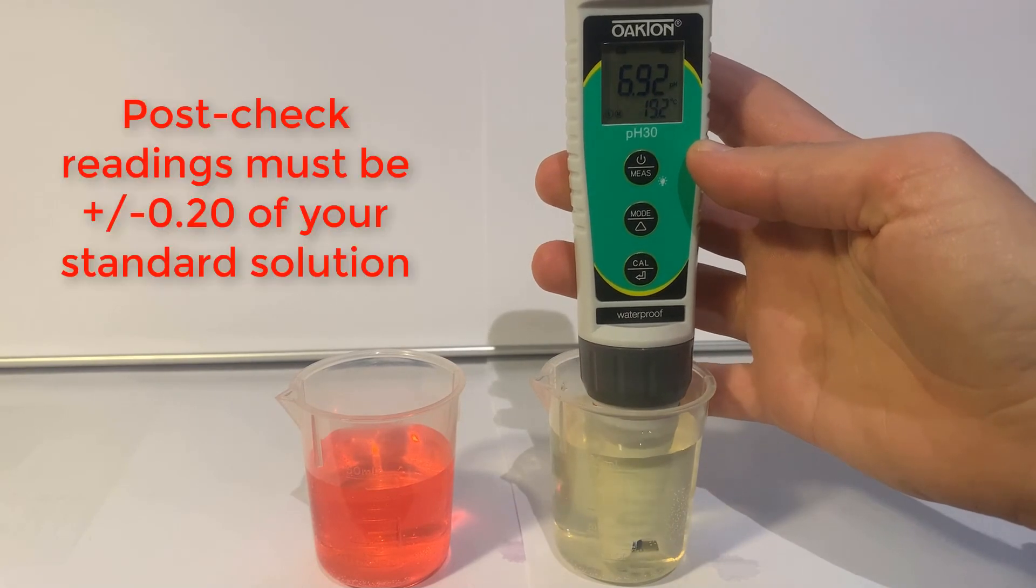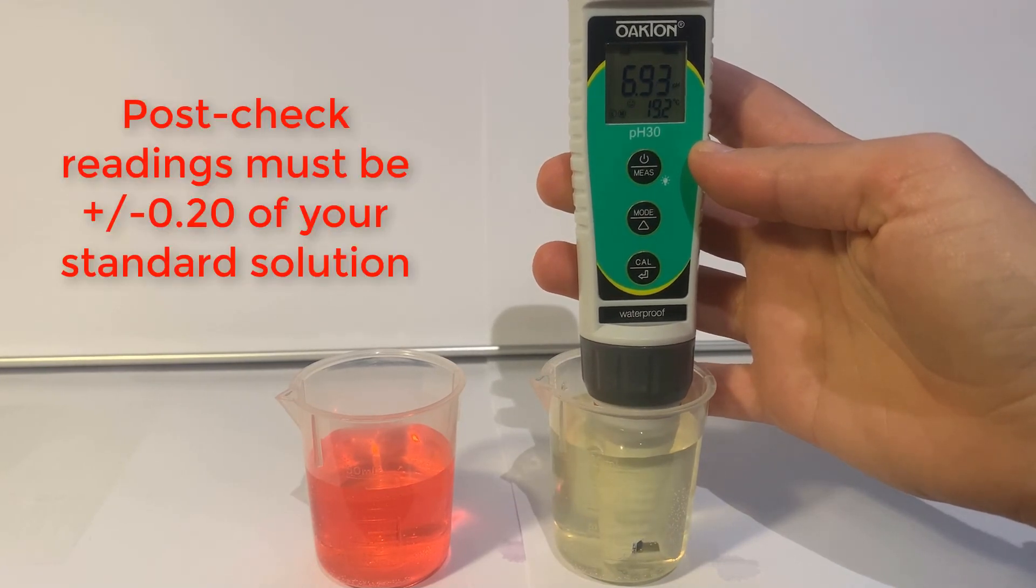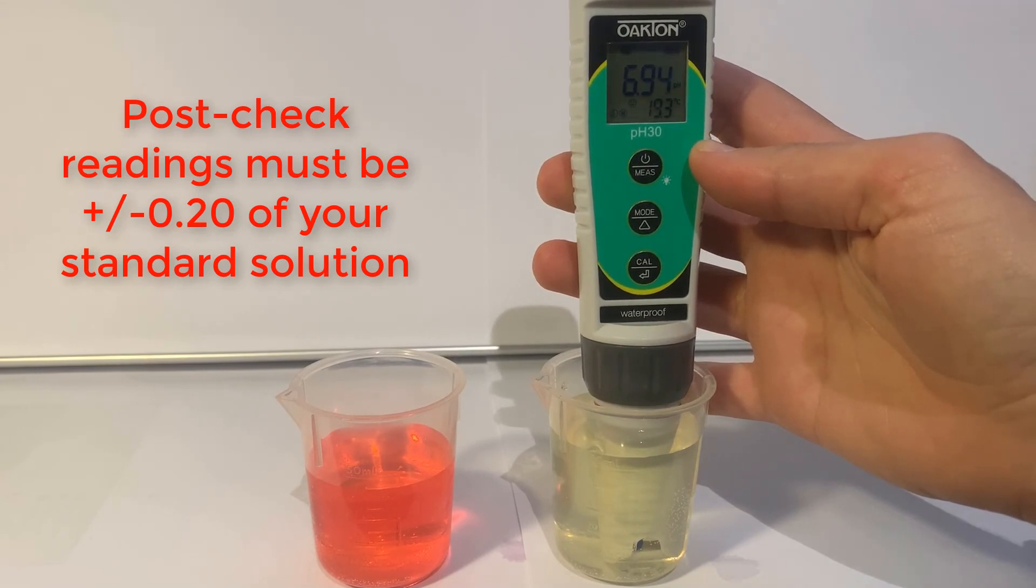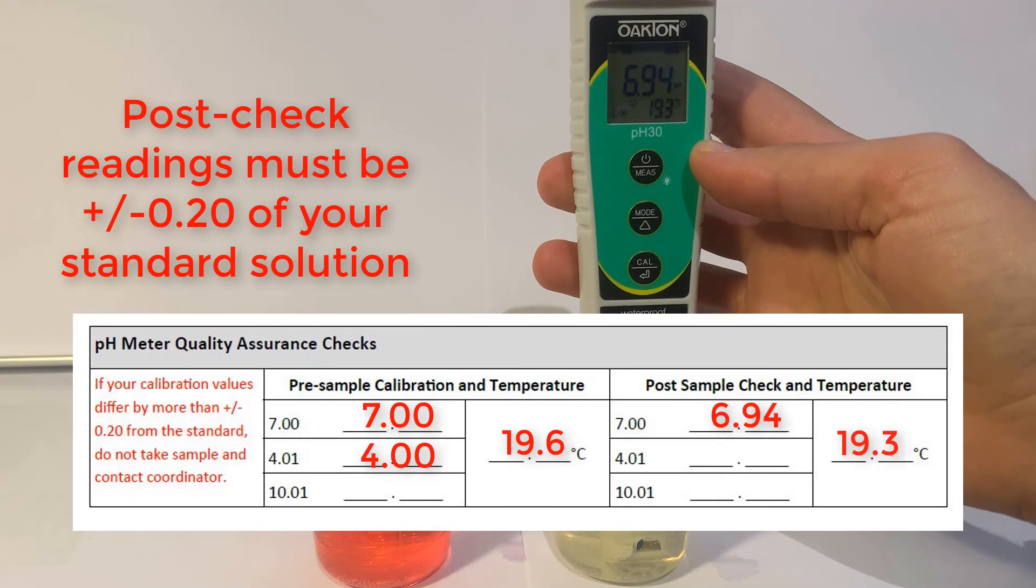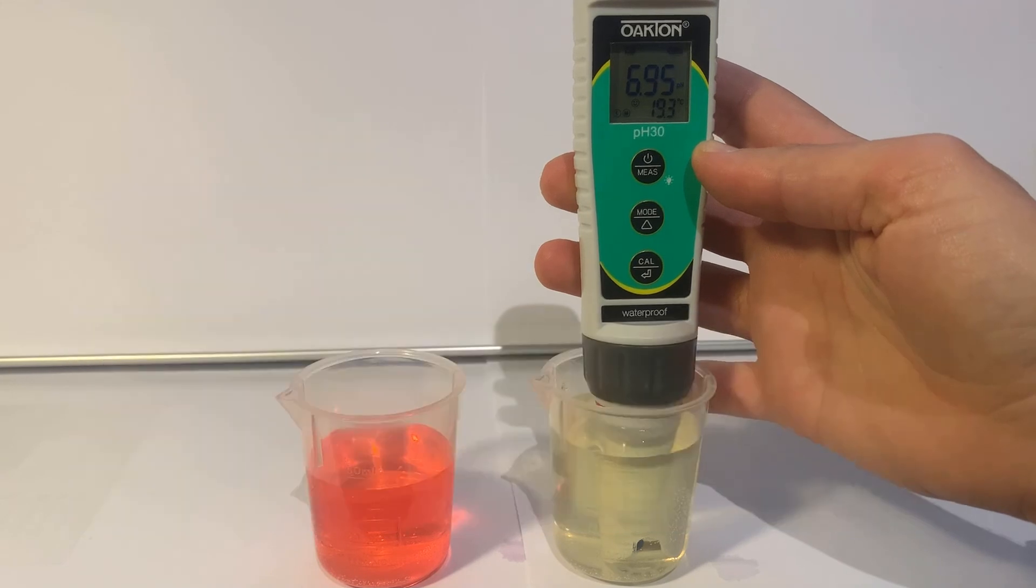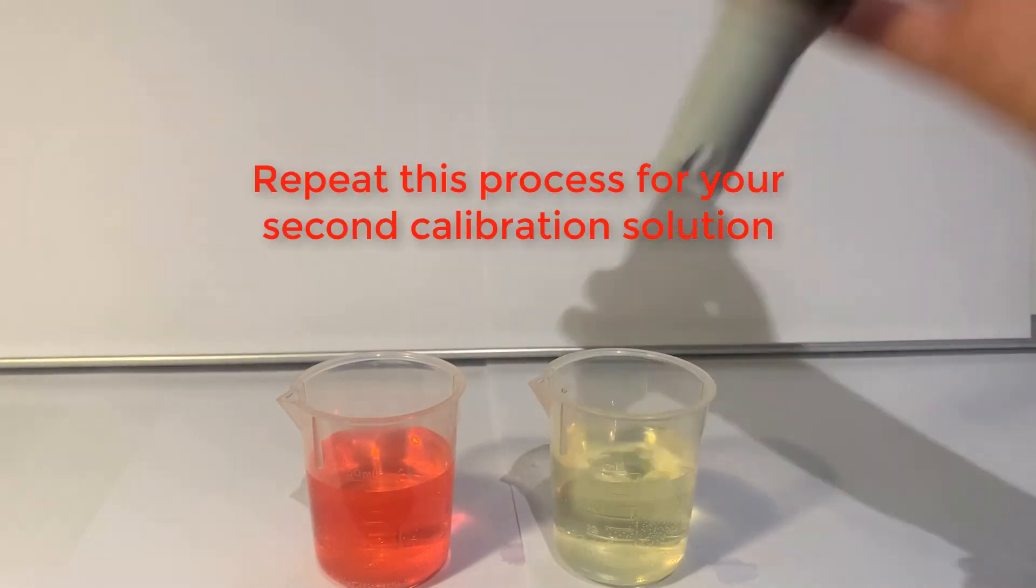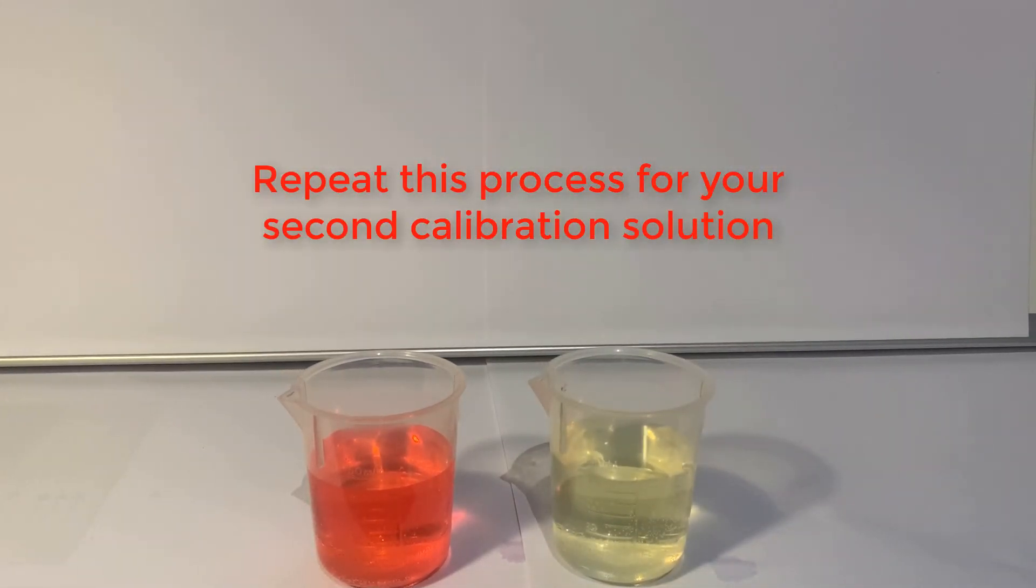This number must be within two tenths of your standard solution, so with Buffer 7 this needs to be between 6.8 and 7.2. If your reading is outside of this range, contact your coordinator for help resolving the issue. Repeat this exact same process for your second calibration solution.